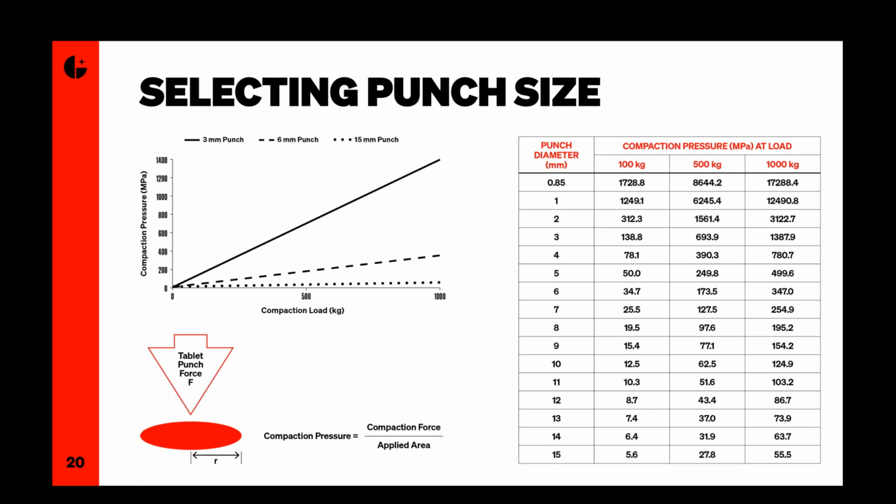And in what circumstances would you recommend to test each ingredient alone instead of the full formulation? It very much depends on what you're doing. A lot of the work that I did in my previous role, I was testing individual components. You can get a lot of information out of that. For change control and troubleshooting issues, say you're having a problem with production, you can zero in on the exact material by testing individual components.